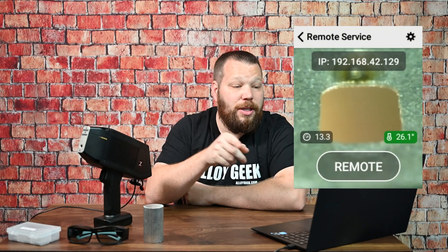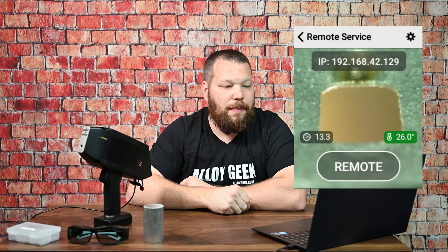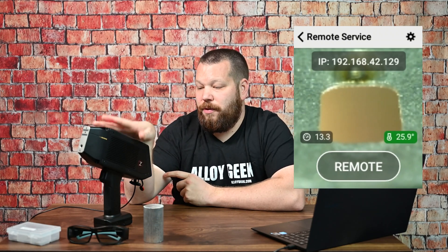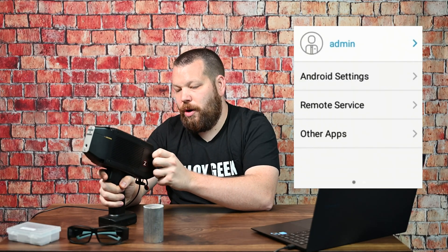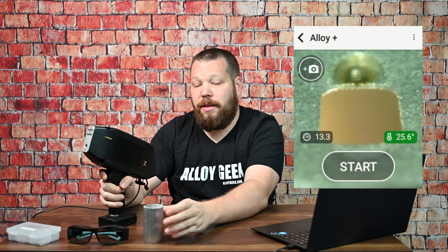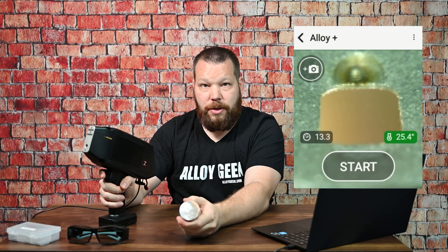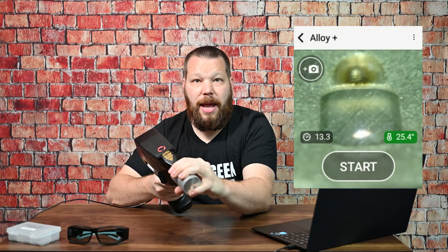What you just saw was the unit actually testing that little bump on the top — that little bump is an internal check standard for the unit itself. So it's happy, everything's good, and now we can actually start working with this unit. I'm going to go into the analyze screen and hit alloy plus — yours might say quick sort if you have a non-argon unit. I'm going to take my sample, which is a piece of 6061 bar stock I got from an aluminum mill. I can hold it in my hand because this is not X-ray, and I'm going to press the trigger one time to do the analysis.